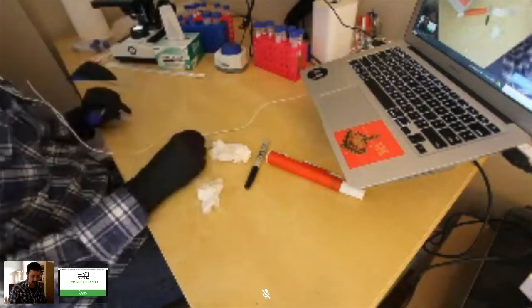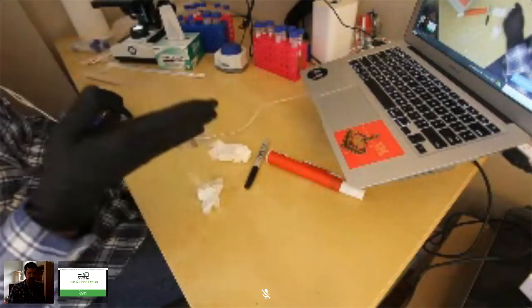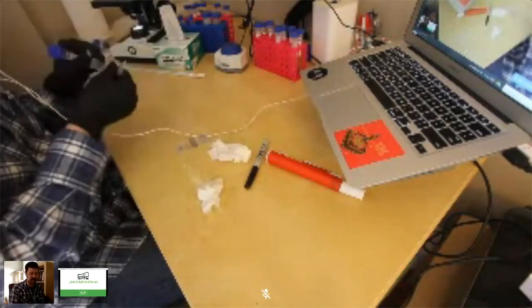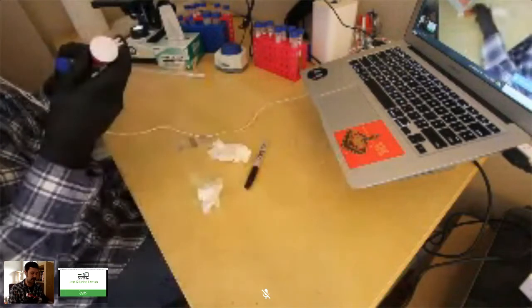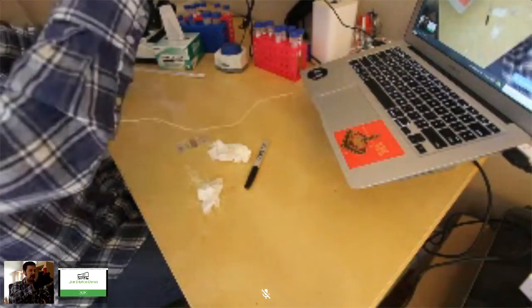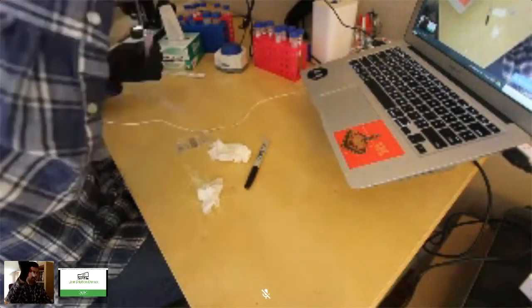But if you end up overloading it, one sample can bleed into the other, and then you've contaminated both of your samples. So you'll need to redo it. Now let's hope I don't screw this up and don't end up having to do that.